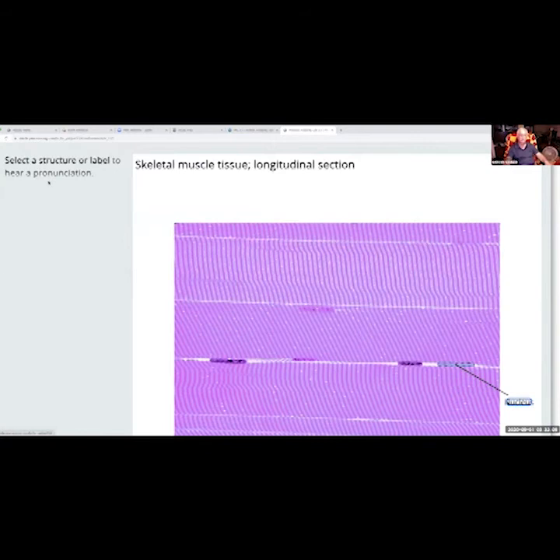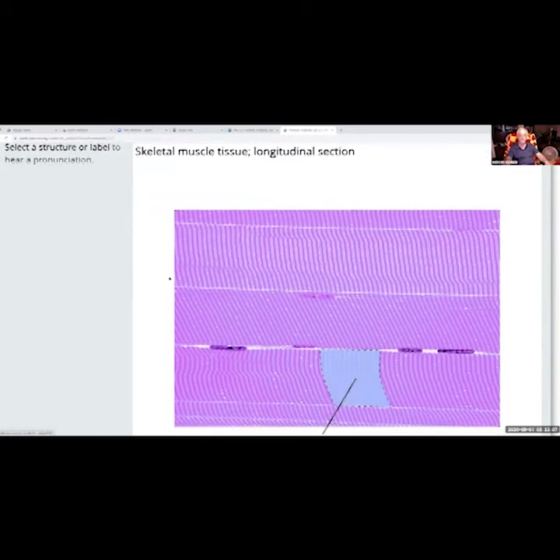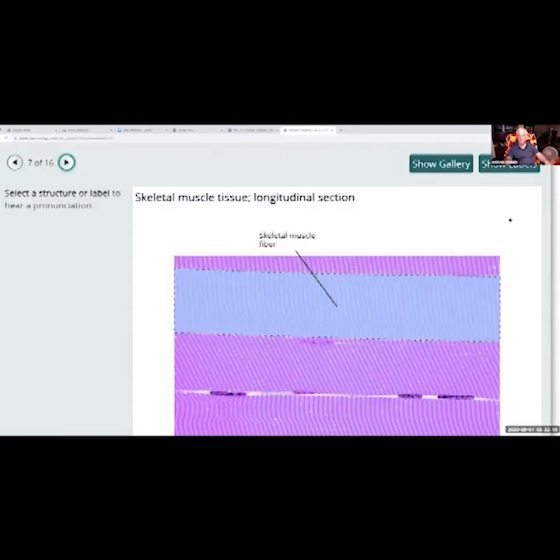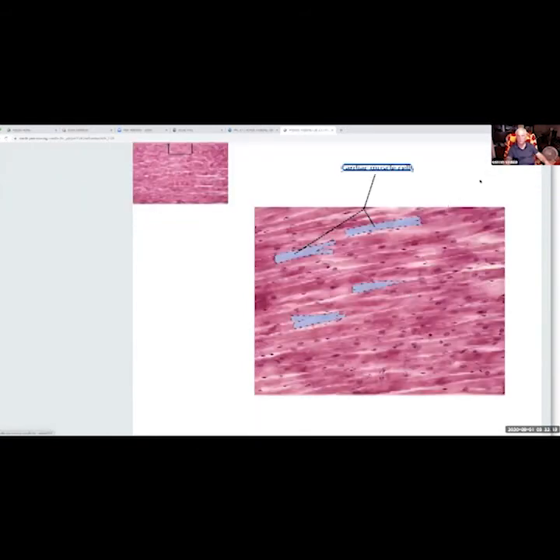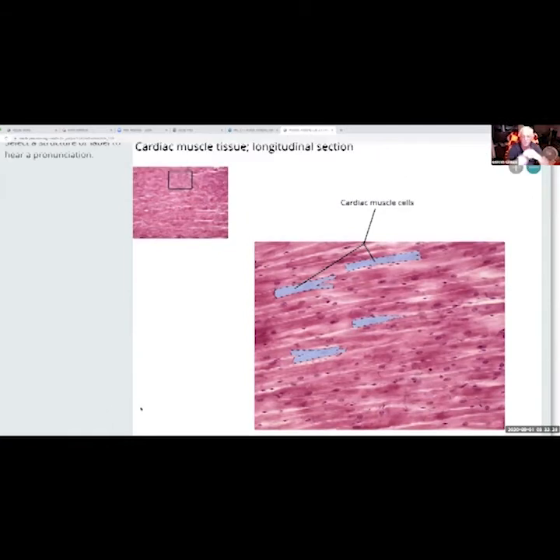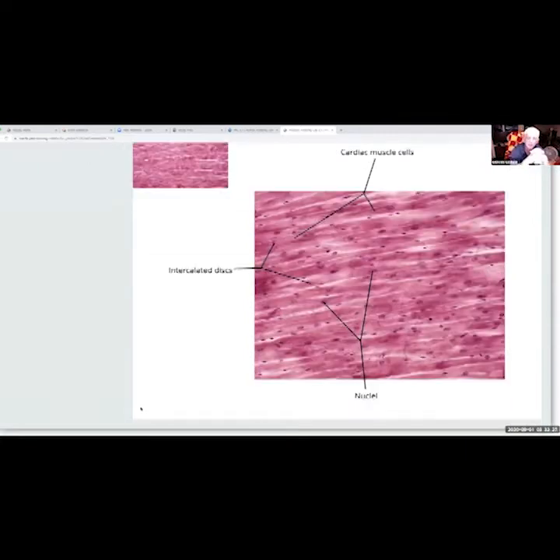Okay. I know I'm kind of beating this to death, but cardiac muscle. Cardiac muscle, see if I can blow this up a little bit. Okay, perfect. All right. Cardiac muscles. There's still striations here. I got to blow a little hard for the striations. But everybody see these little lightning bolt lines, kind of right here, right here, right here, right here, right here, right here. All those lines, when you see that and it's striated, you know it's cardiac muscle.